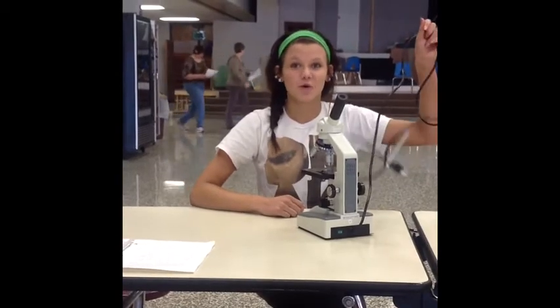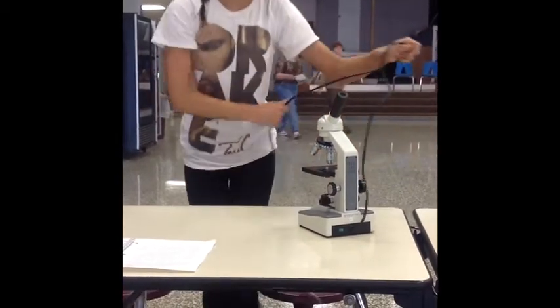You are now ready to use your microscope, so flip the on switch. But before you do that, you need to plug in the cord — sometimes people forget it, it's a tricky task.